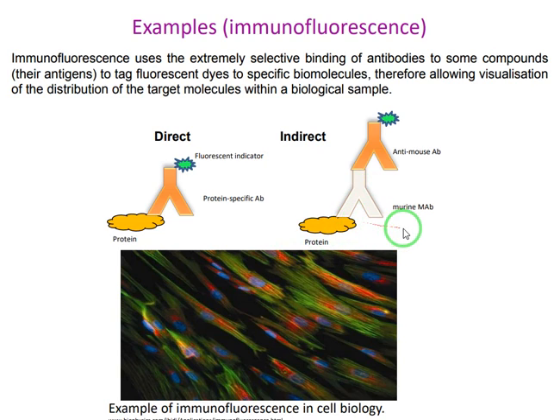The advantage of this technique is that because these are animal source antibodies, they are not too expensive on one hand, and on the other hand, several different secondary antibodies can be bonded onto the heavy side of the primary antibody, so the intensity of the light can be increased.